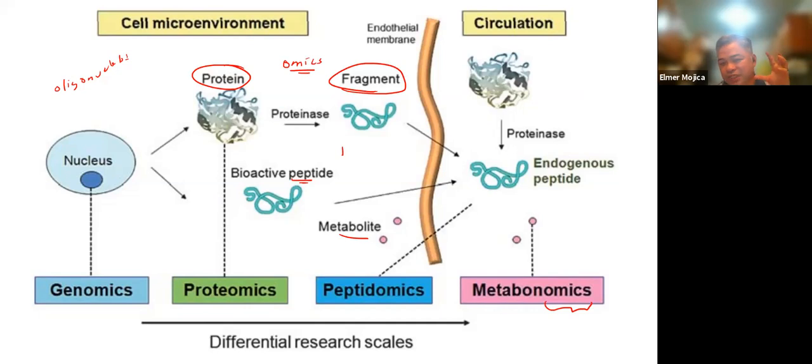So in all of them, yung role ng mass spec, they can determine the protein structure, the function, the folding, and its interaction. They can identify a protein from the mass of its peptide fragments. Kasi marami ng study ngayon. So parang ang ginawa nila kapag nag-breakdown into fragments, parang nagkakaroon ng signature mass to charge ratio. And they compile it into a library. So para pag nag-run ka, isa-search mo lang yun sa library.